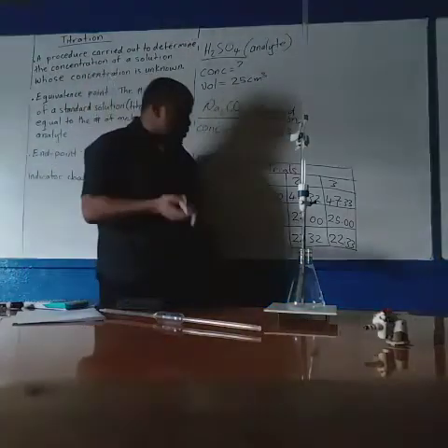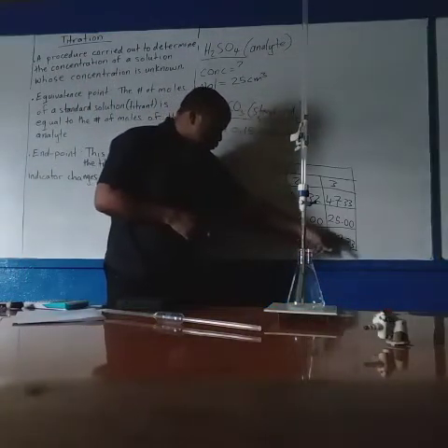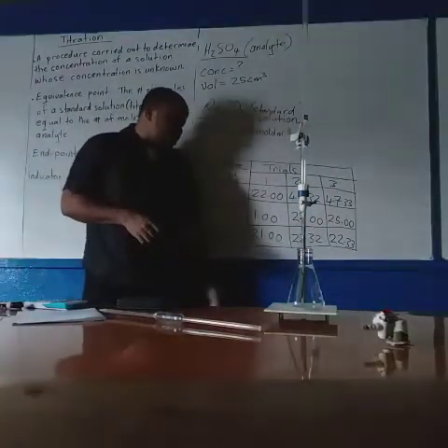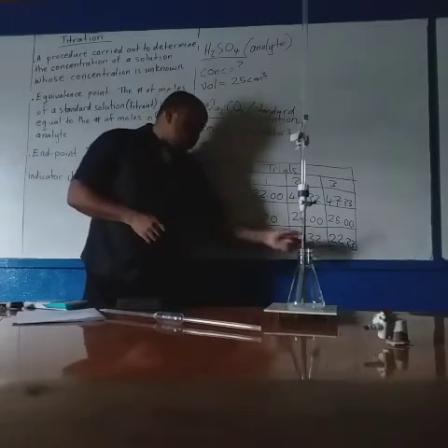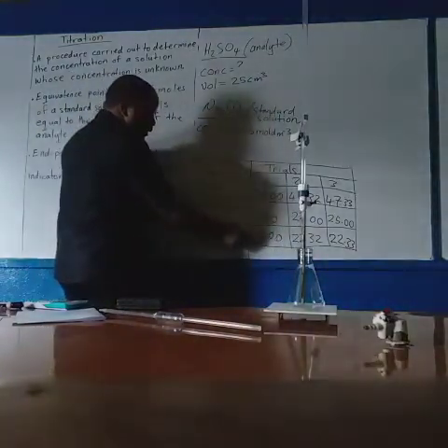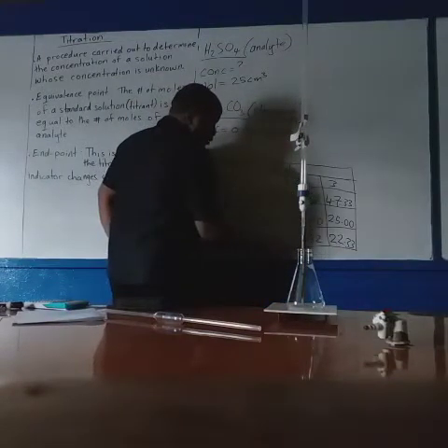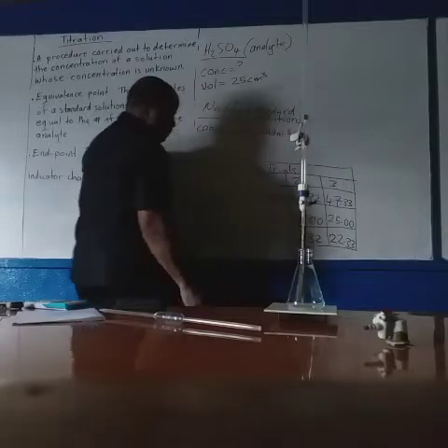So you do it a third time, and the volume used here is 22.33. So these two numbers are extremely close. These two are accurate. So when you are going to do your calculation, you will not use the 21. You will use your two closest numbers, so 22.32 and 22.33.